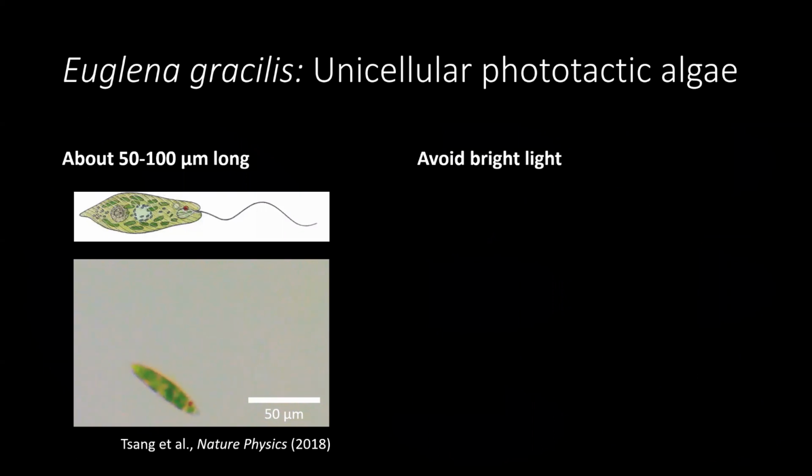As you might expect, given the name Pac-Euglena, the organisms we feature in this game are Euglena gracilis cells. Euglena gracilis is a unicellular organism that moves in response to light stimuli, tending to move away from bright lights. Euglena are really great for biotic games. They're small, being about 50 to 100 microns long, which means that setups for housing, stimulating, and observing them don't need to be all that large. Euglena cells are also easy to take care of, requiring only access to light and air. They photosynthesize, so they make their own food, and we don't have to supply them with anything extra. They can also be kept for months at a time in the same test tube.